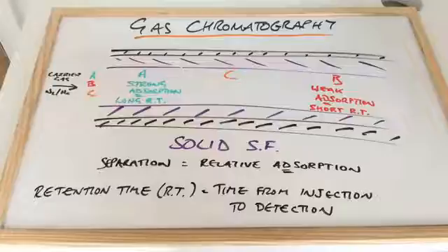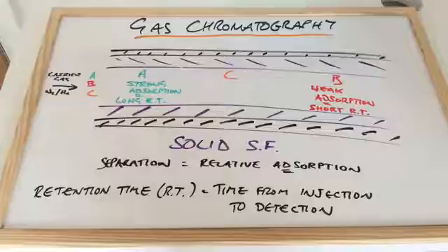So the retention time, as you can see I've written, is the time from the injection of the sample of the mixture to the detection of the component. Remember, these are separated out by the relative adsorptions.